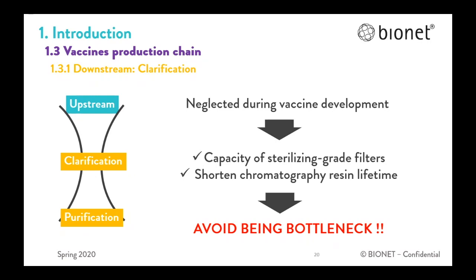A poorly optimized clarification step can negatively impact the capacity of sterilizing grade filters or may shorten a chromatography resin lifetime. For all these reasons, the clarification step must not be a bottleneck. In this context, TFF is living up to the new clarification challenge, addressing increased process flexibility, the possibility of single use, and reduced investment costs.